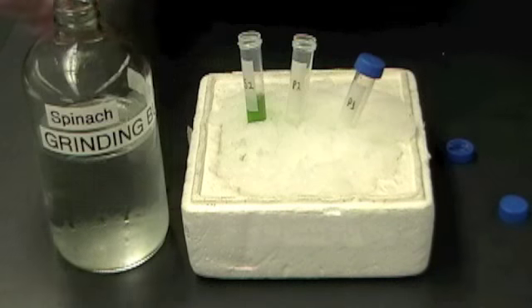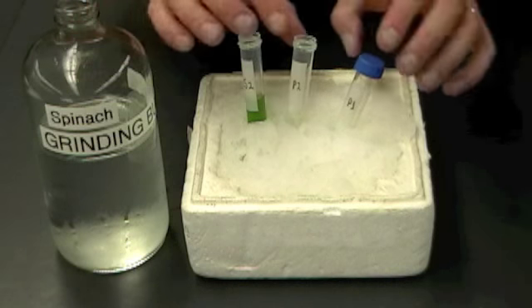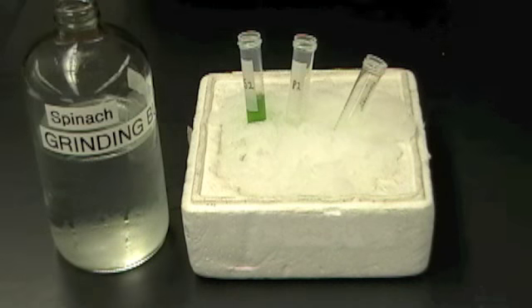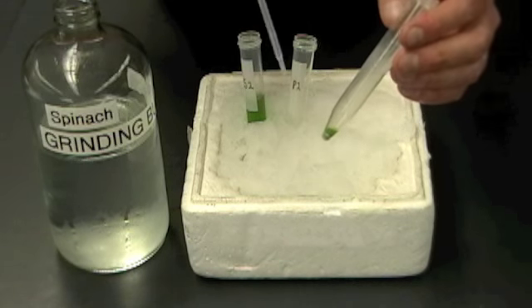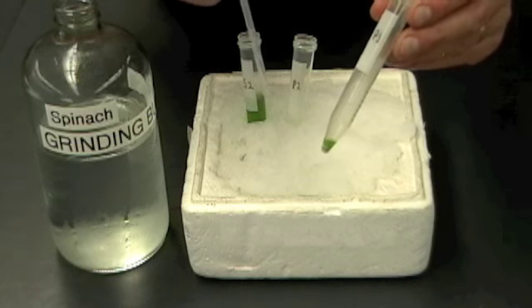Now one of these 3 is going to contain our chloroplast that we'll be using for the rest of the experiment. But before we check for that, we have to resuspend these pellets, which means to break them up and get them back in solution. And this is a step where a lot of people go wrong because they don't do this well enough. Spending a little extra time at this point resuspending these pellets can really save you a lot of time down the road when you start analyzing your chloroplast.